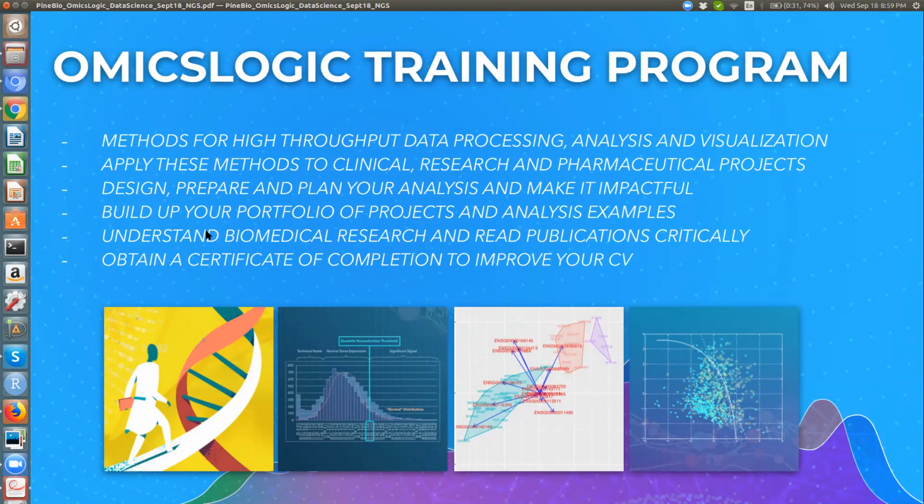So we'll be covering the data sources, and we'll be covering all those analytical pipelines which are used to analyze those data and come up with a plausible interpretation in terms of genomics, transcriptomics, metagenomics, and epigenomics as well. We will also be covering a lot of things inherent to biomedical data analysis, which is data visualization. And we use RStudio.